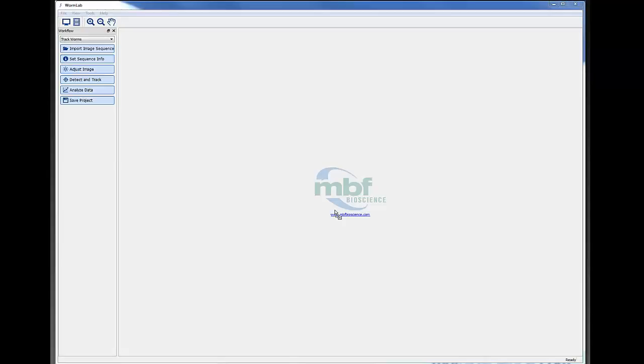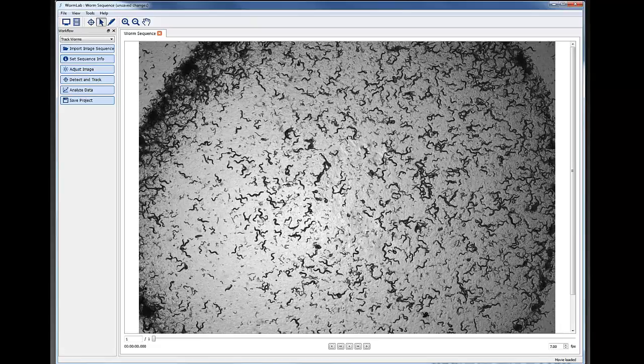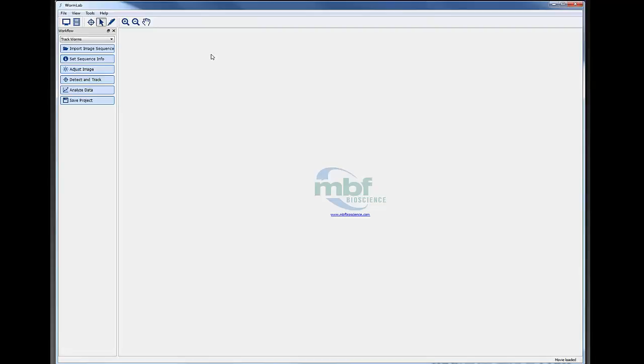If you look at something like this, a pretty good rule of thumb is if you can't tell what's going on in the video, in other words, a reasonably intelligent human user says, well, I can see that there are multiple worms overlapping, but I can't resolve that. This is an example where worms are collecting at the edge. So to more precisely answer this question, when two worms interact, we can track that. When three worms interact, it does become difficult. And beyond that, when they clump, you will lose the tracking at that point.